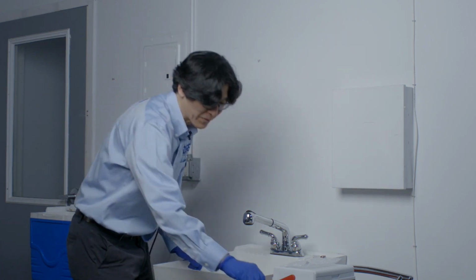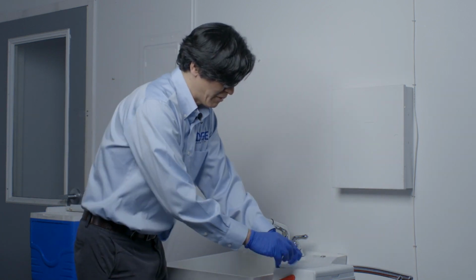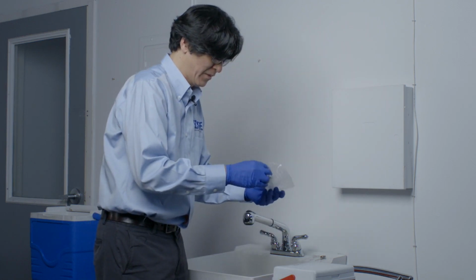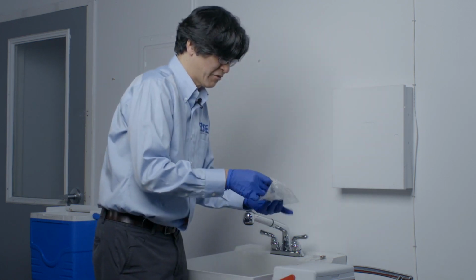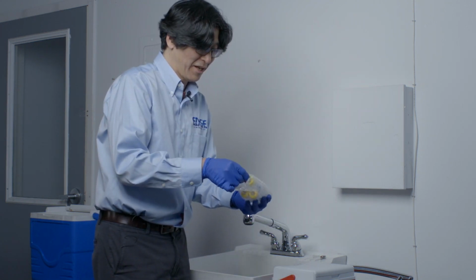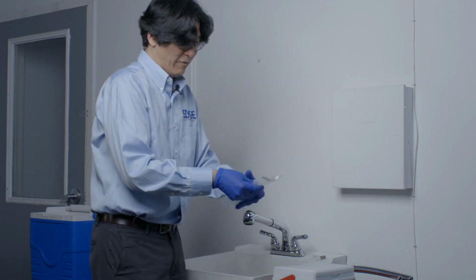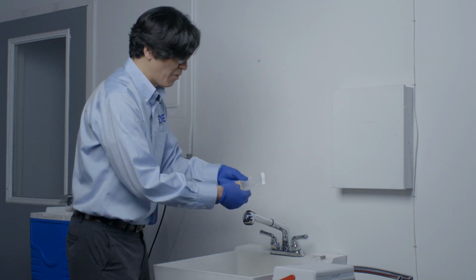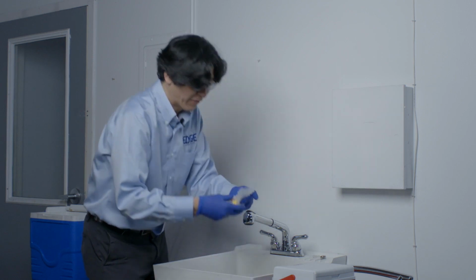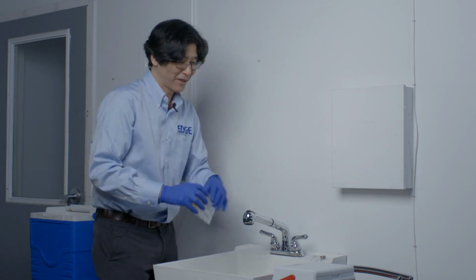That's a VOC sample. What we want to do is continue this on with the next sample, and when we're all done, we're going to take these two vials, place them back in here with the trip blank, and this one would be filled. We're just skipping that to expedite things here. We can put all these little red caps back inside the vial. We want to have this package all buttoned up, so we take off the little plastic tab here. And if these things are more secure and nice and they're not moving around, it's less likely to break.